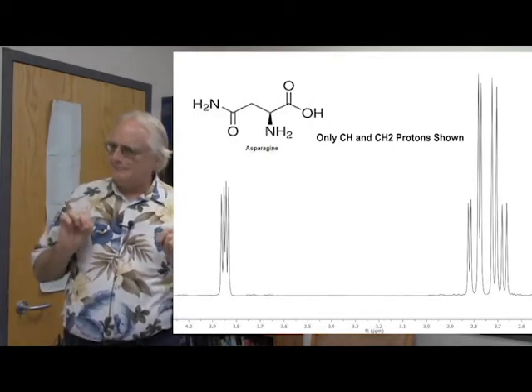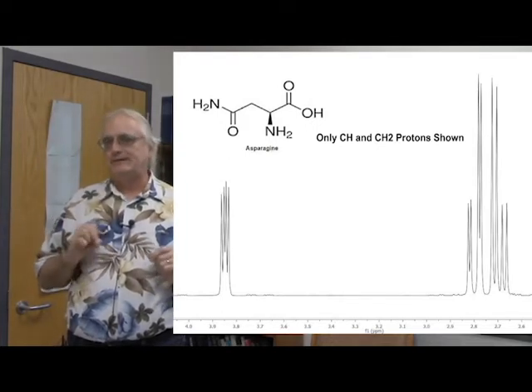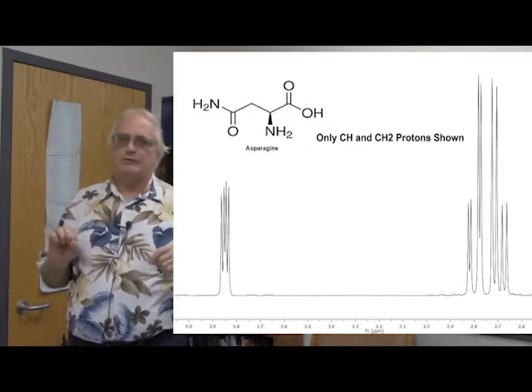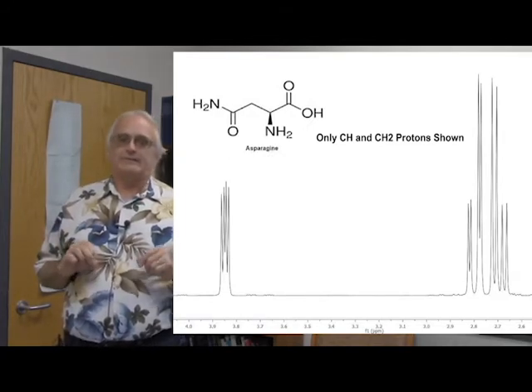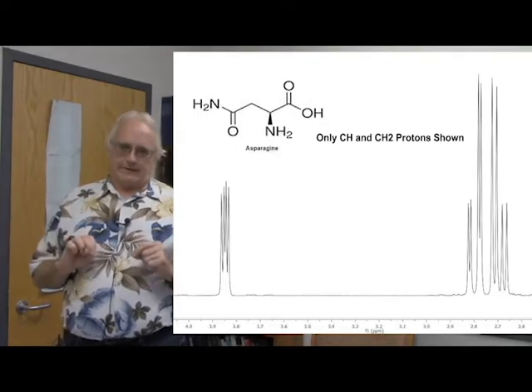This is a much more complex looking CH2 group than FMOC had. We do not have a doublet and we don't have a triplet. We've got other things. Now, technically, we have a doublet, and we have actually sets of doublets here. I want to point this thing out here. This is actually the CH2 group.